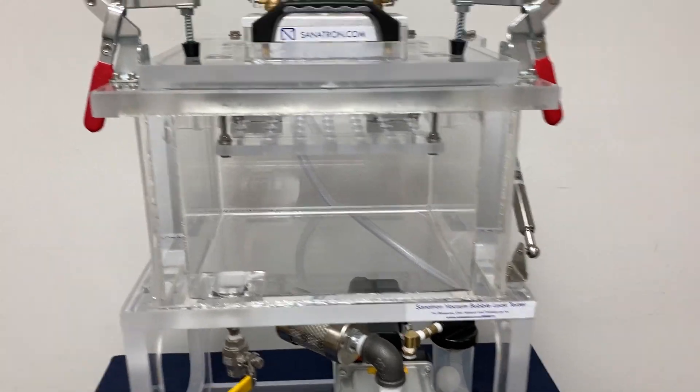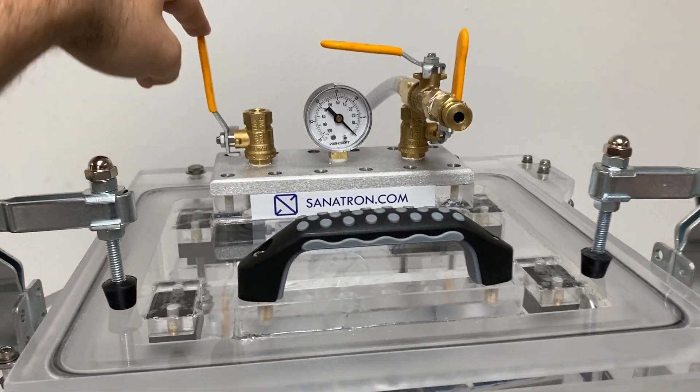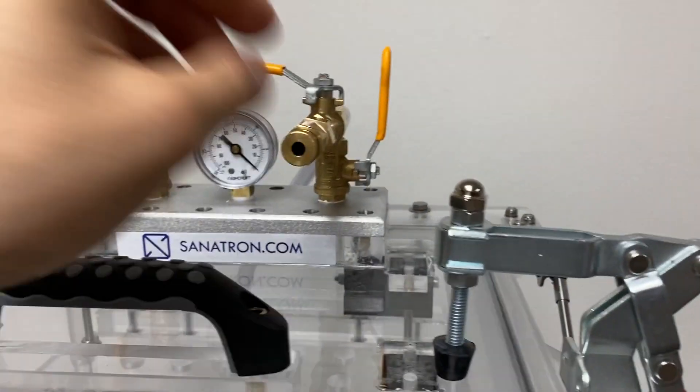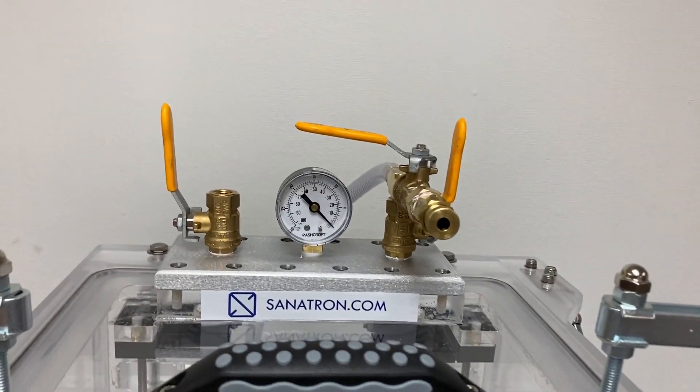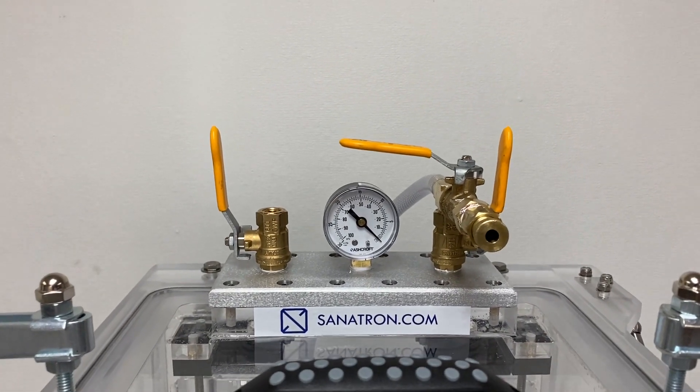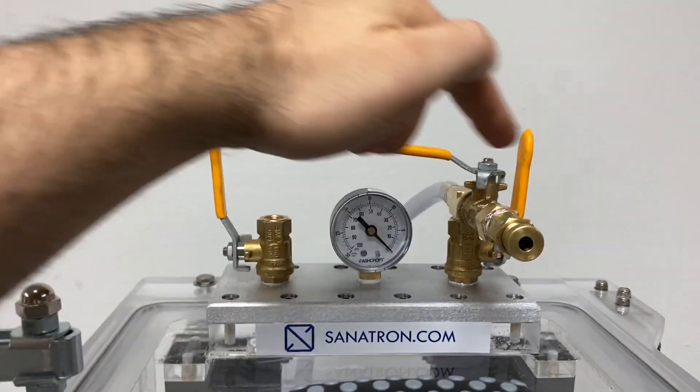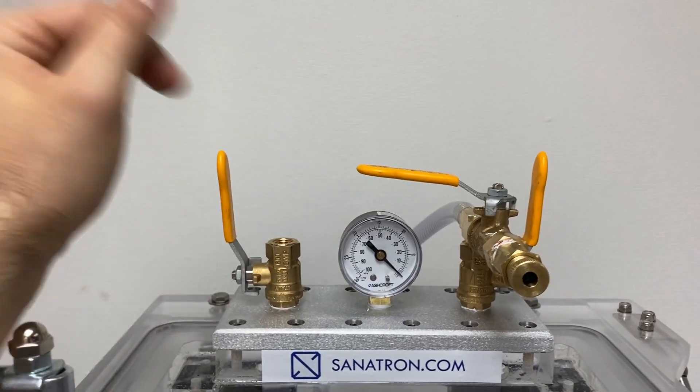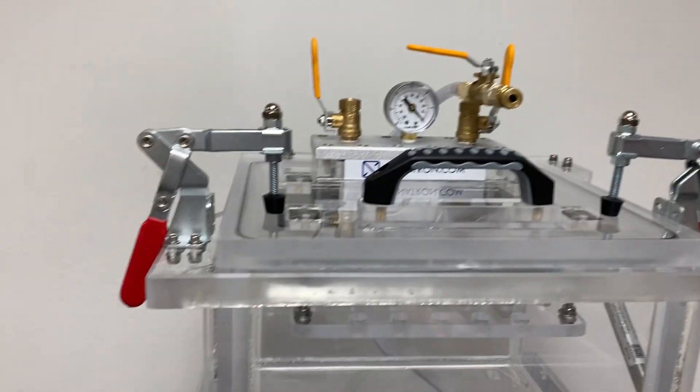As with all of our acrylic vacuum chambers, they come as standard with a venting valve and vacuum valve. This one in particular has a vacuum adjustment valve where you turn it back and forth to adjust your vacuum. You can set it to 15 inches of mercury, set it and forget it, and the next time you pull a vacuum it's going to pull to 15 inches of mercury. It also comes with a dial vacuum gauge, dual scale, inches of mercury and kilopascals.